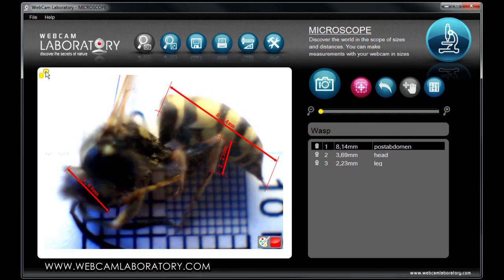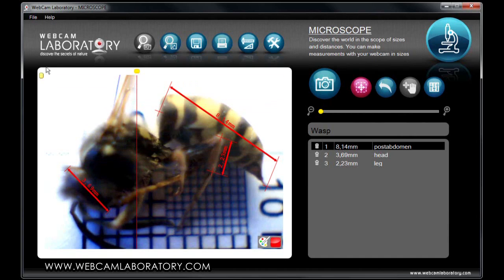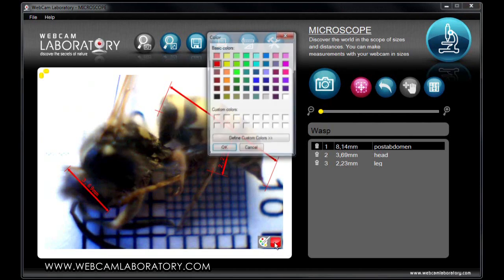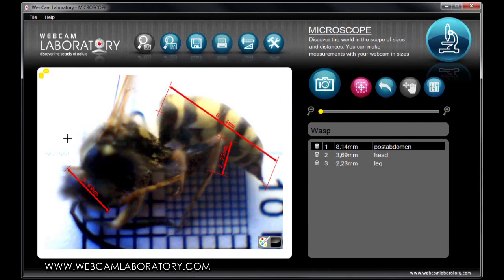Using the two yellow slide bars in the top left corner of the screen, you can activate auxiliary lines in order to assist your measurements. In the right lower corner, you can find the color selection window. Using this window, you can select the colors for the measurements, so you can always use a color that is easy to see. If you have selected these, the next measurement will take place using the selected colors.